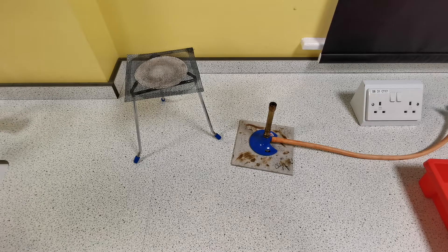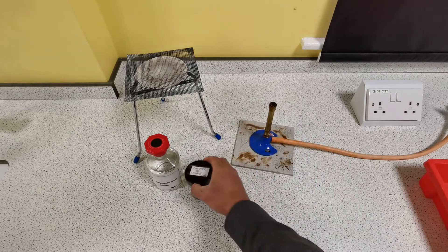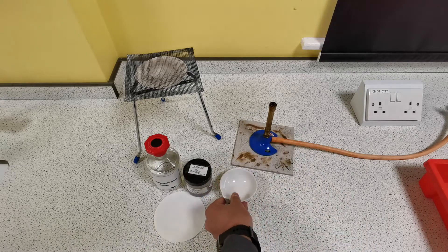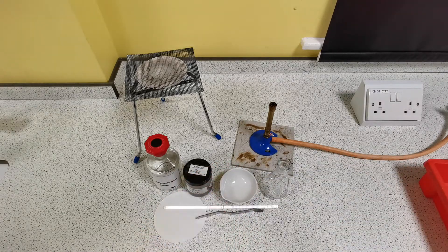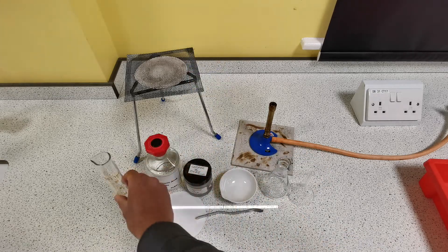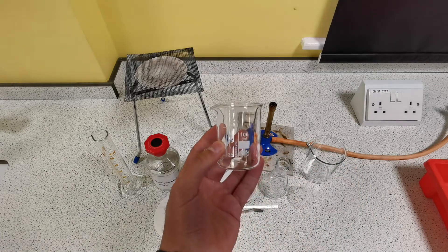Today I'm going to be showing you how to prepare a pure dry sample of copper sulphate crystals. To do that you're going to need sulfuric acid, copper oxide, some filter paper, an evaporating basin, a conical flask, a spatula, a stirring rod, a filter funnel, a measuring cylinder, a 250 millilitre beaker, and finally a 100 millilitre beaker.